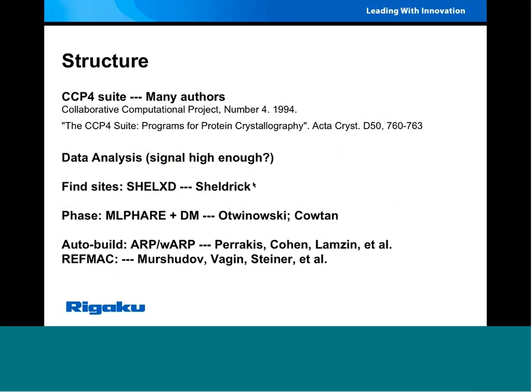I want to say this now. The user interface for this is actually quite easy to click buttons and get stuff going. But they're writing scripts and building scripts and running some underlying programs. They use the CCP4 suite, which is, of course, written by many people. This is the reference for that. I want to make that clear.